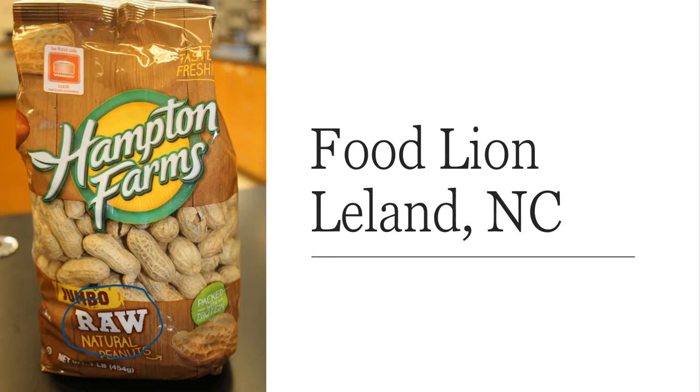All right, so it's going to be my job to go in and extract peanut oil from these peanuts that you see in this bag. On the inside of those peanuts, we have oil, of course, right? And maybe Chick-fil-A wants to buy that peanut oil to fry their stuff in. Well, okay, we're going to have to be able to get the oil some way, some form, some fashion. And a Soxhlet extractor is going to allow that to happen on a small scale for us.